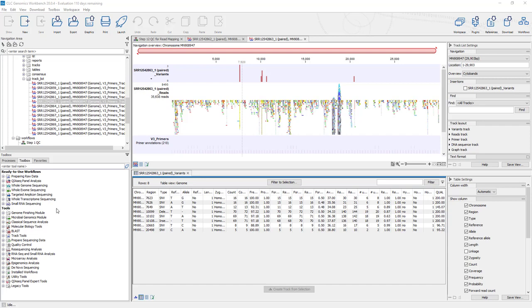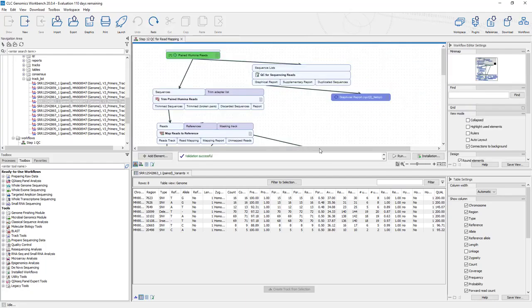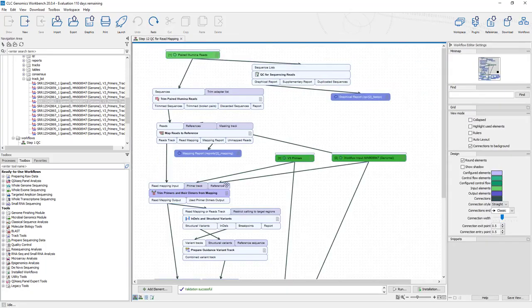And that's what we're going to talk about now. So the modules we're going to introduce are the iterate and the collect and distribute. So let's go back to our workflow here. And so this is a different way of batching rather than hitting that batching button: this is iterate and collect and distribute. I think the best way to demonstrate it, or for you to understand it, is just to watch how it works and how I change our workflow.